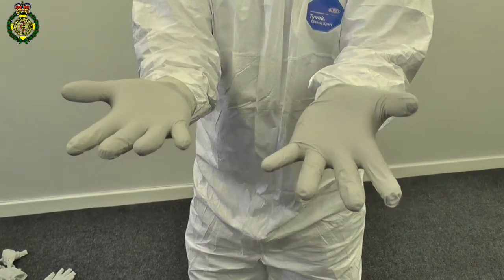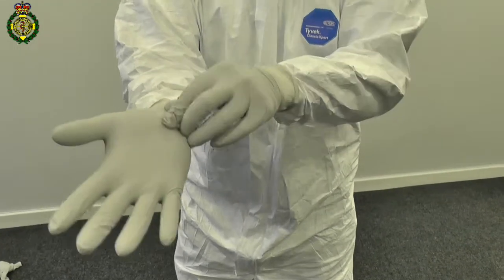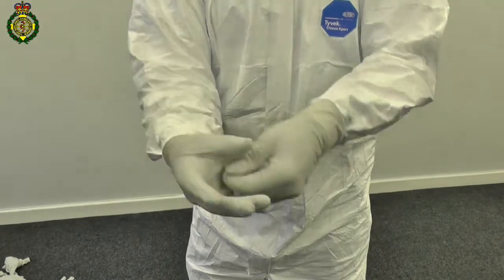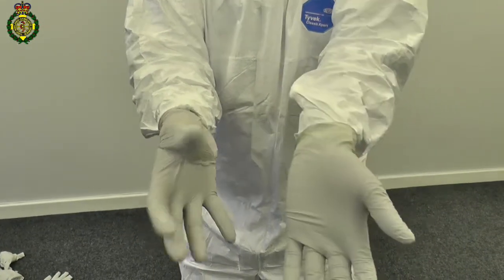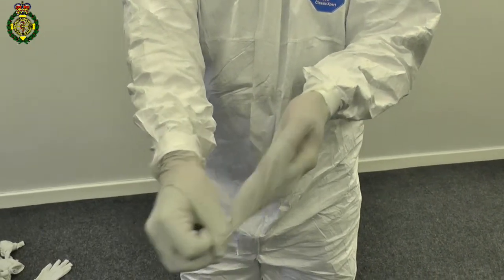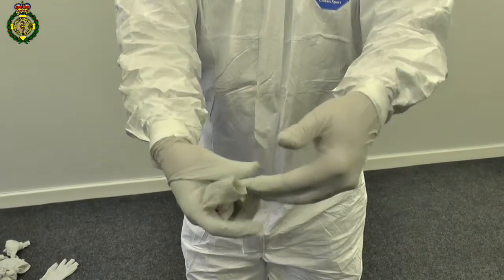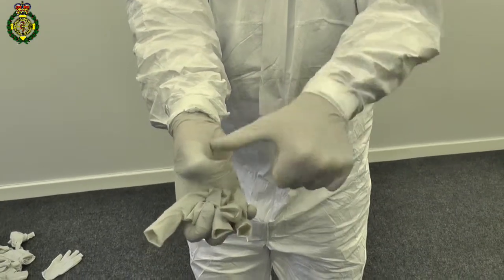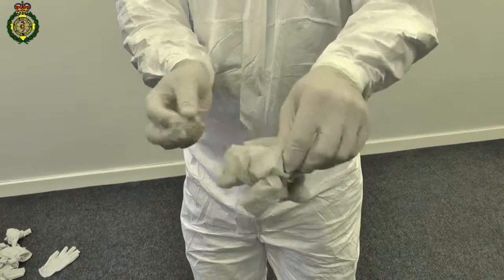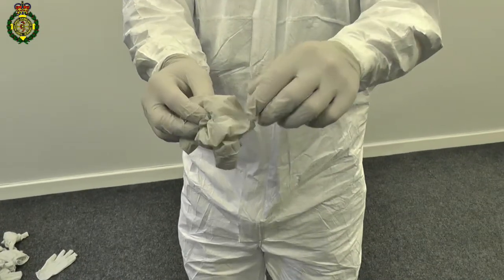To remove the top pair of gloves in order to change them for clean ones, pinch the top glove on one hand on the wrist by the thumb. Pull the glove up and over the thumb, exposing the inside of the glove which is clean. Use the clean thumb to turn the other glove inside out. Dispose of the dirty gloves. You can now put on a clean second pair.